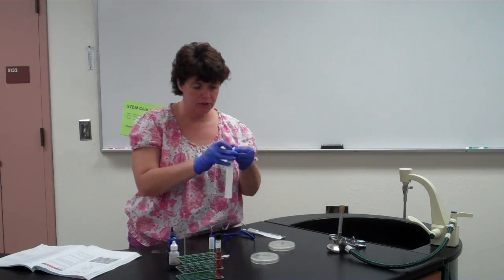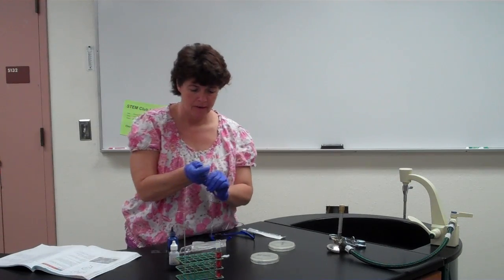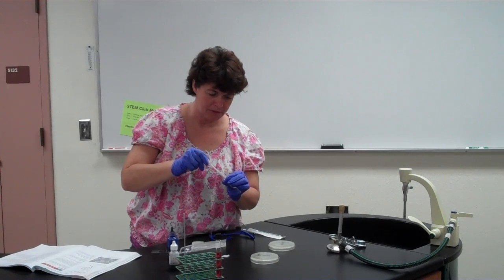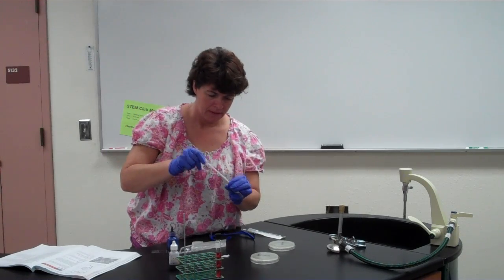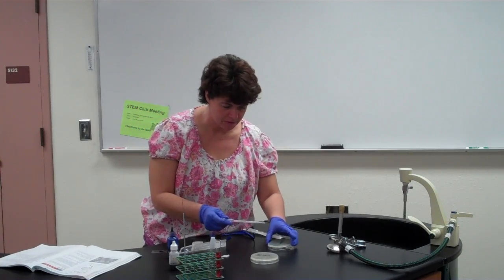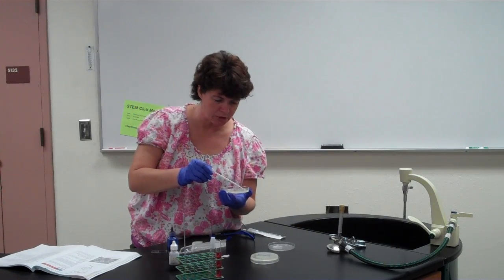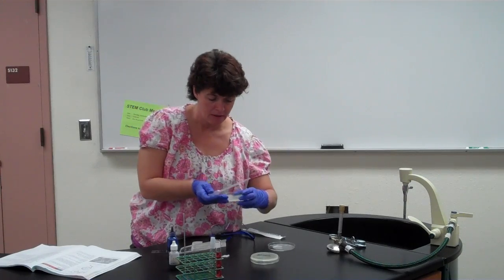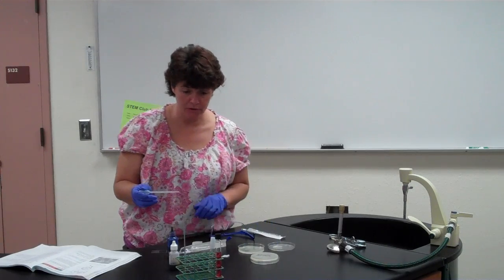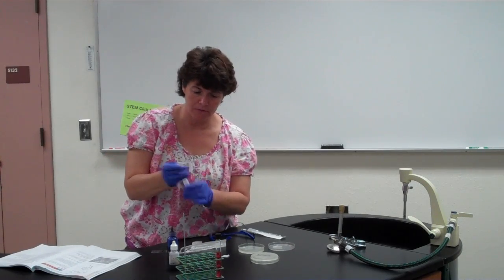Let's open this guy first. So you're going to use a little pipette, and then you're going to take just a little bit of the yeast suspension that you've made, and you're going to put a drop of it. I guess I will mess up this plate. Oh well. So in the section where that one is labeled, you put one drop, just a drop. You don't spread it or anything of that particular yeast. Okay? And I'm just going to squirt the rest of it in there. So then you'd immediately put this into a sterile bag or the autoclave bag.